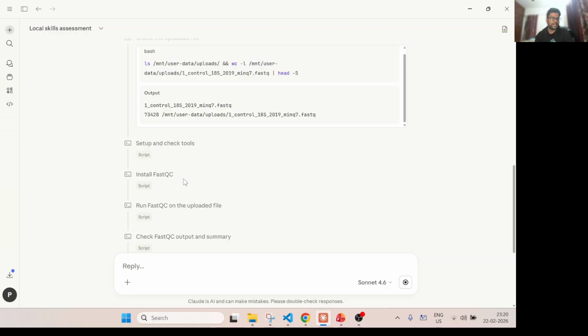So you have to download the analysis, and that's where you have to use an alternate approach, like Claude Code or the other framework, the Claude SDK agent that they support, which will run on your local system, or you can host an EC2 instance and use it there. But for demonstration purposes, we are using this QC analysis.